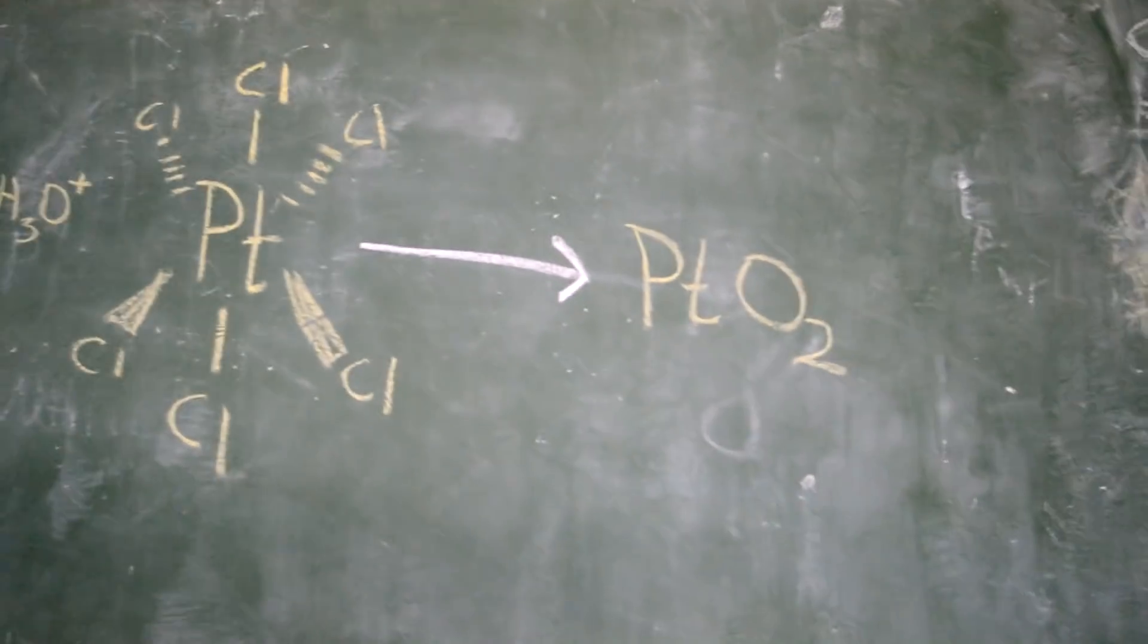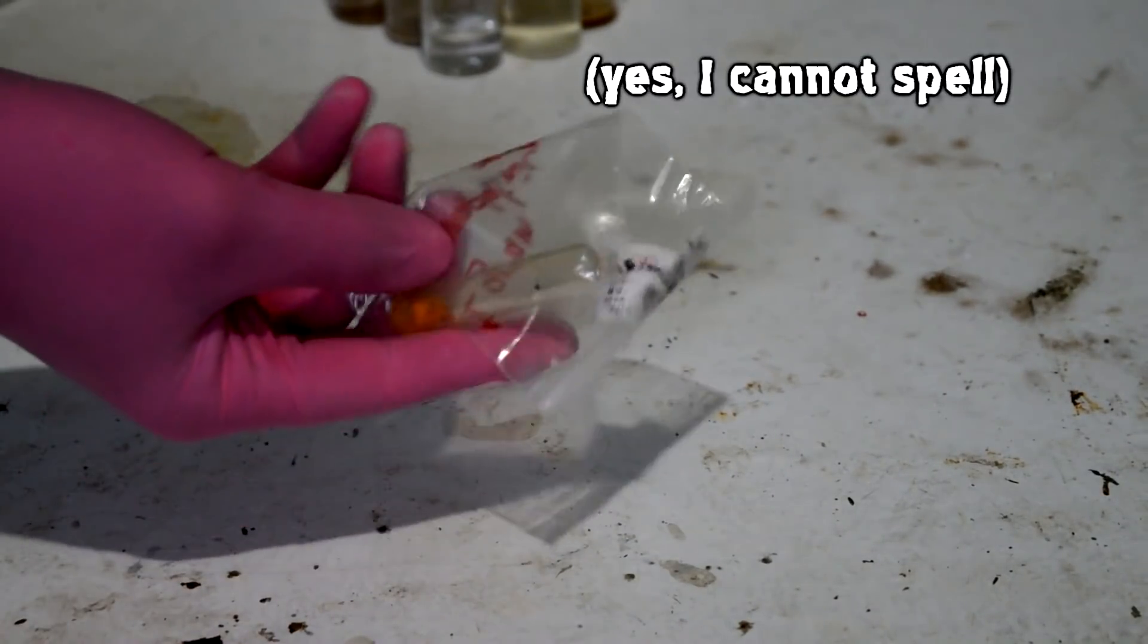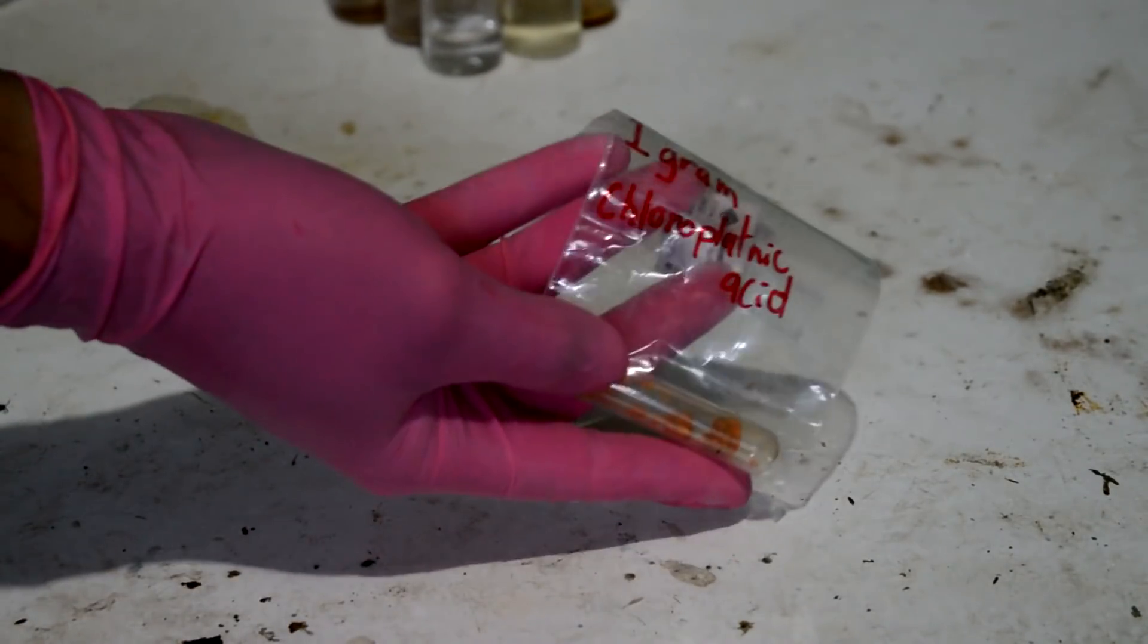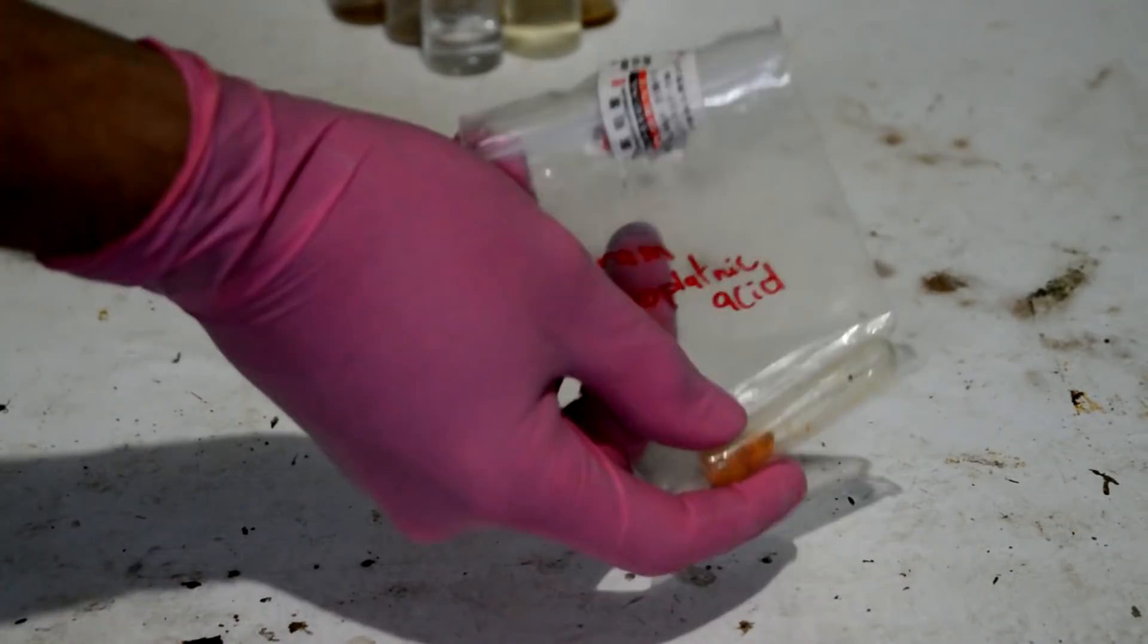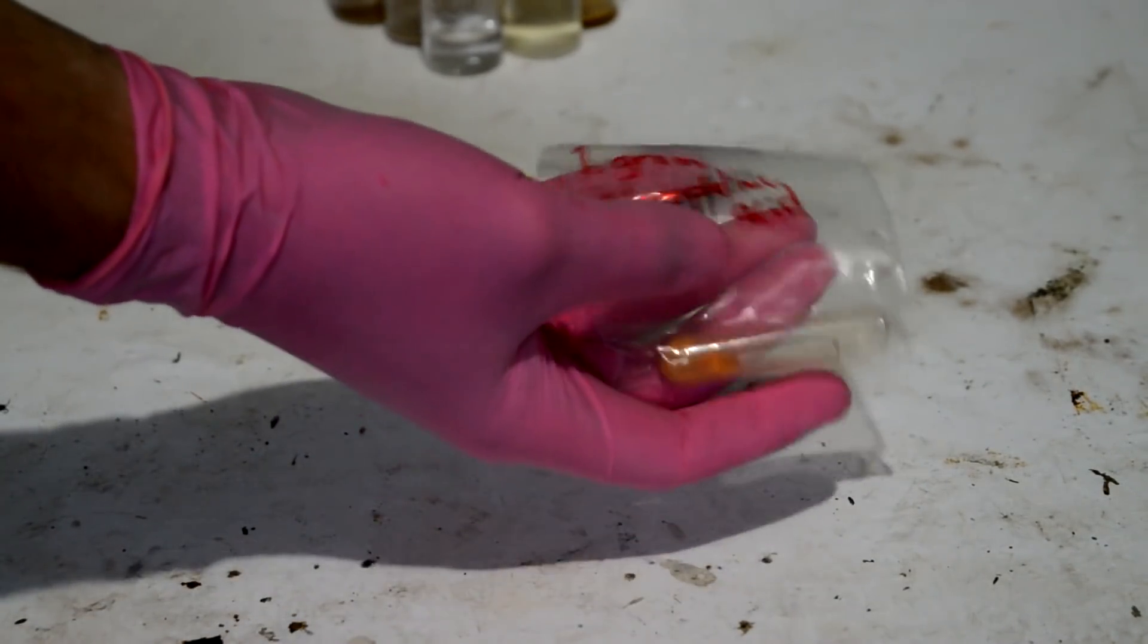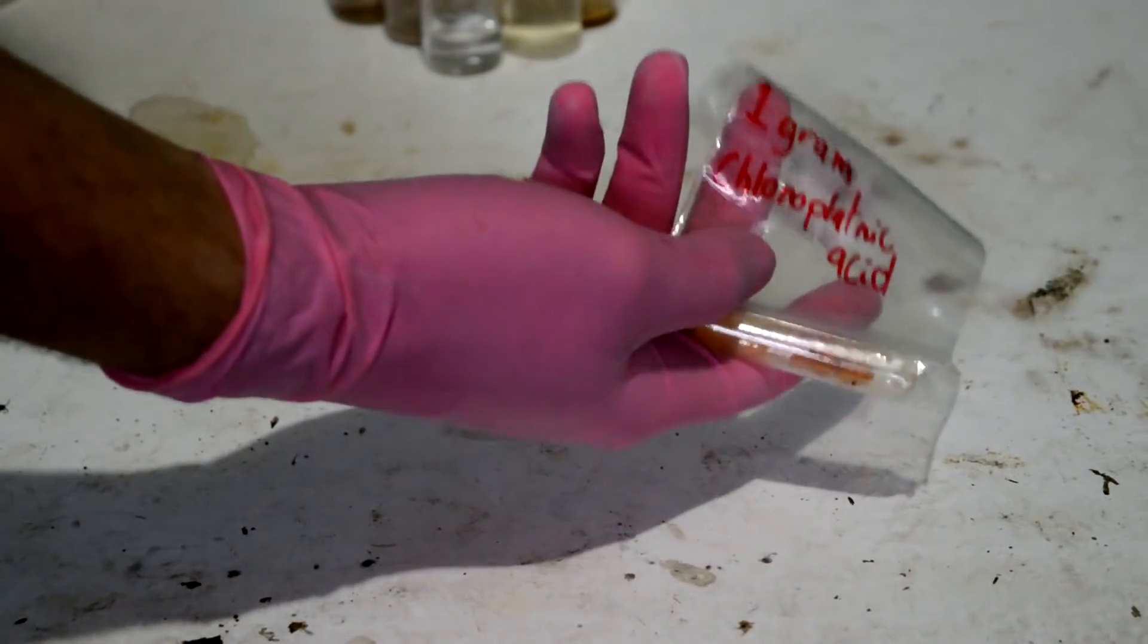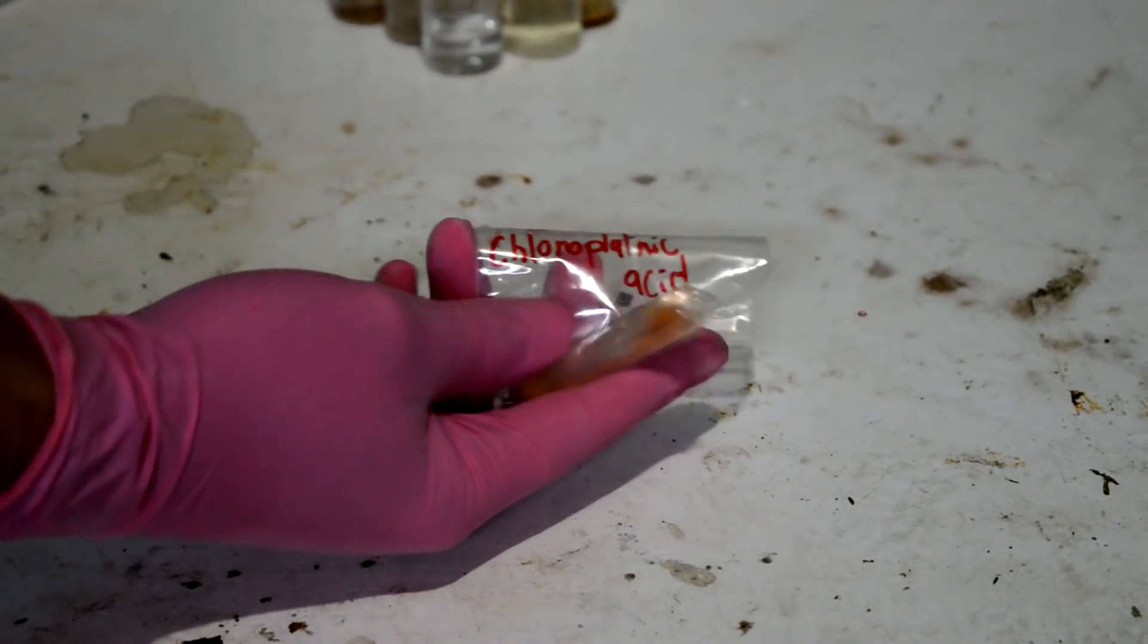The first important property of platinum is that it is quite expensive. I have one gram here in this cute little plastic vial. I bought a gram and a half off Chinese Alibaba through Aussie Chemist. I think this one gram was about $50 or so. It's expensive, but it's not prohibitively so.